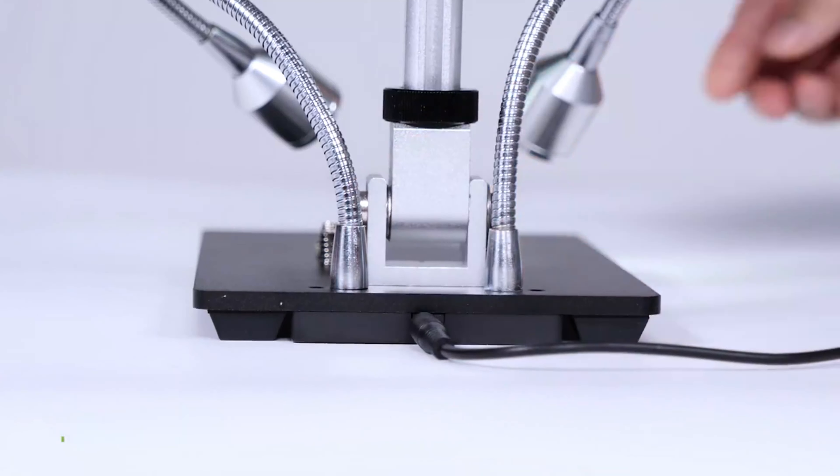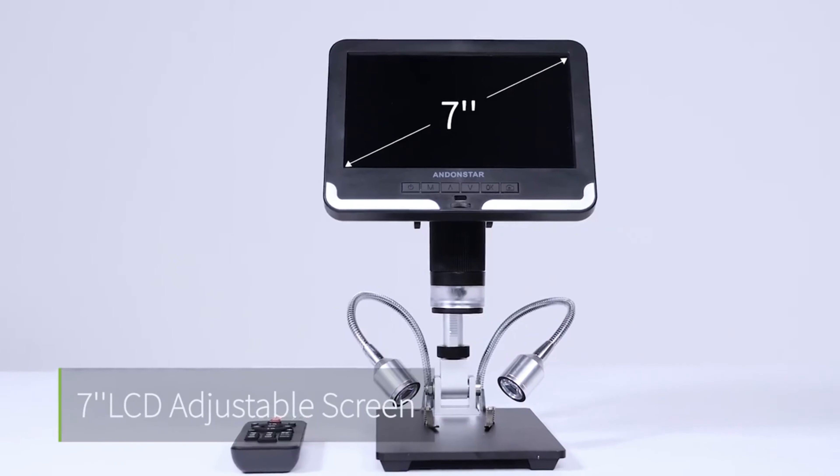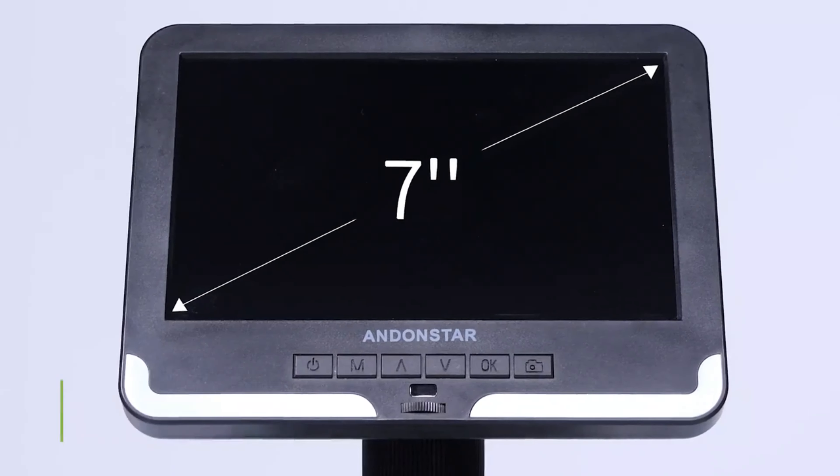Hi guys, today's video we're going to check out the 3 best Andonstar HDMI microscopes on the market. This list was made based on our personal views and are listed based on rating, review, orders, price, quality, durability, and more.